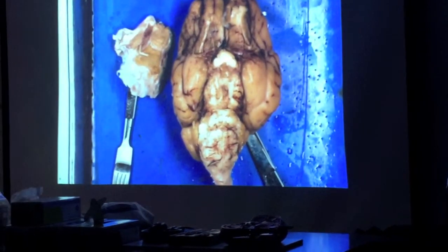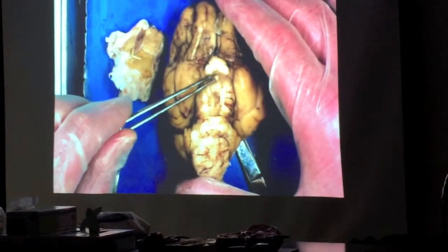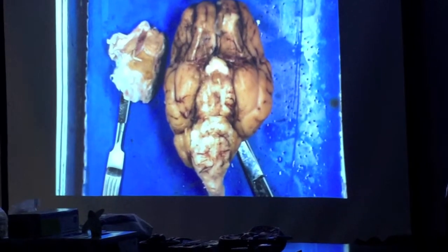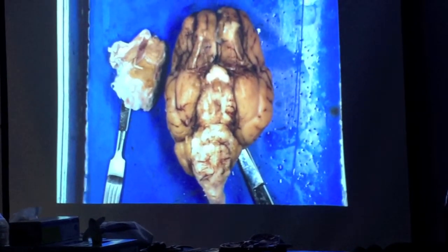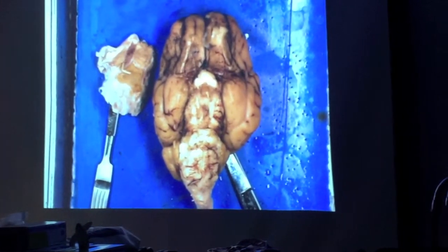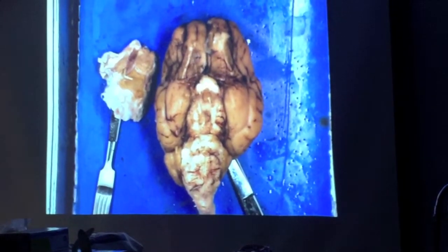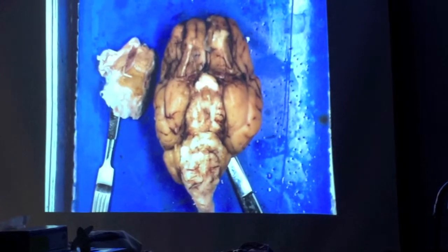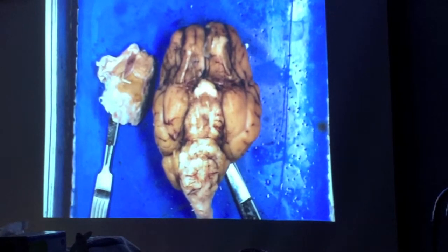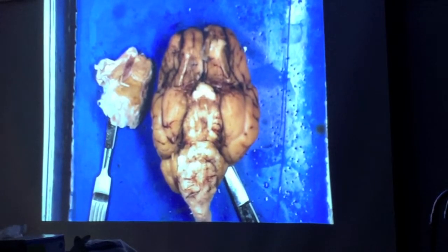So as we continue on the ventral side, that tube that was connecting to the pituitary gland, that's the infundibulum. That's the stalk that allows the connection between the hypothalamus and the pituitary gland. Again, remembering from topic 13, the endocrine system, the hypothalamus releases hormones that are carried by a special set of blood vessels to the pituitary gland, the anterior pituitary. It also has a direct connection through the infundibulum to the posterior pituitary to release hormones like ADH and oxytocin. So this is a connection that allows the hypothalamus to communicate with the pituitary gland. So it's vitally important for the functioning of those systems.